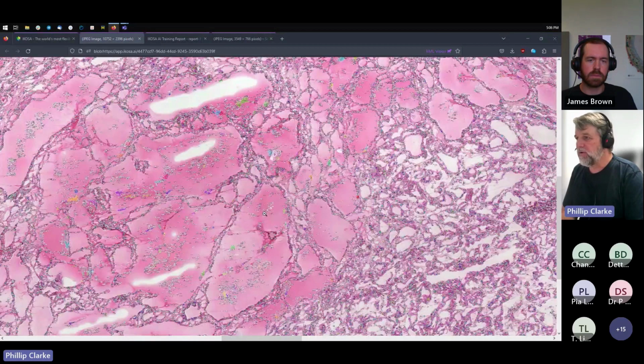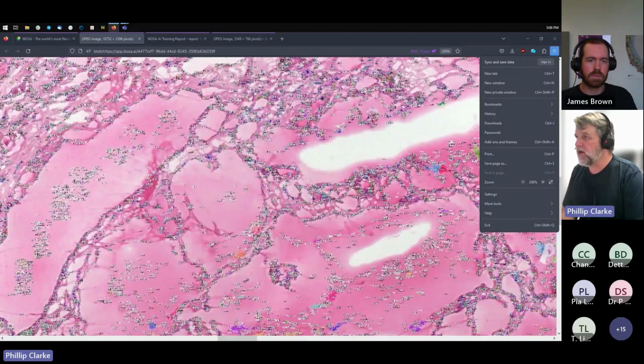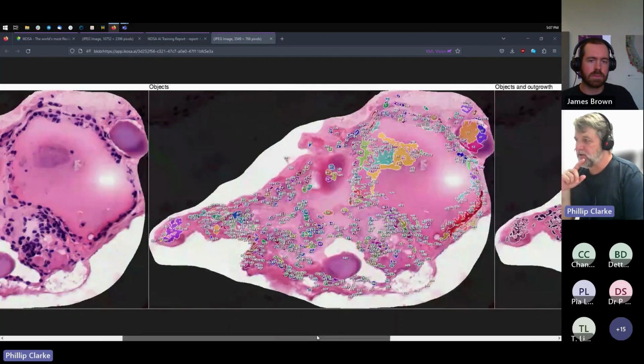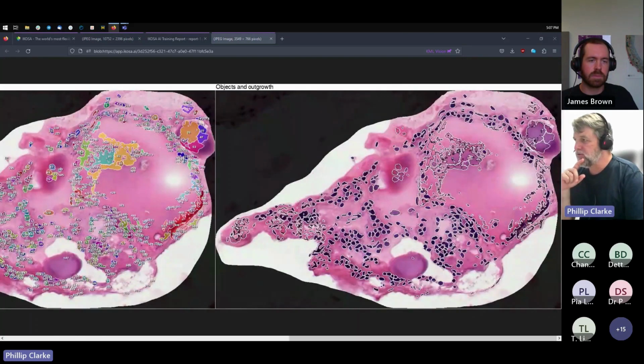And then in the middle we have the same thing, but there are numbers assigned to those cells, and those numbers basically correlate with what's in the CSV file. So if we have a look at the one we submitted, the webinar sample 5, which only had the region of interest. So here is just the region of interest that we wish to analyze. It's much easier to see here the numbers that are assigned to everything that it found. So all of these cells is what that application found within that region of interest.